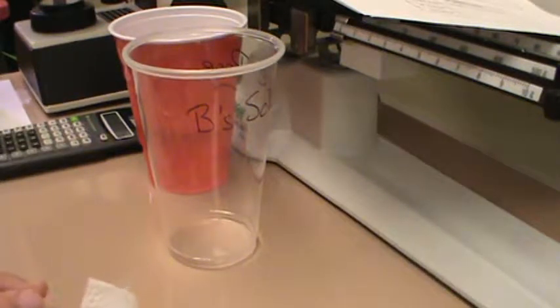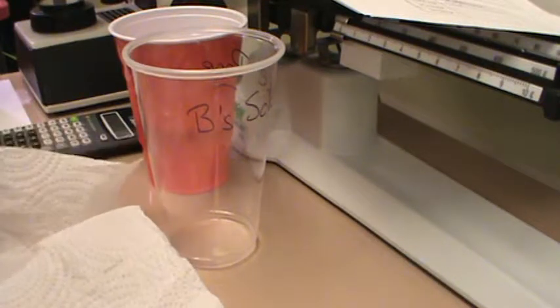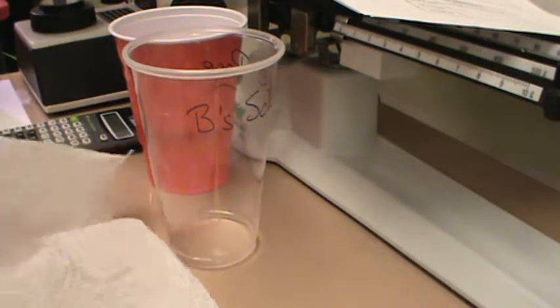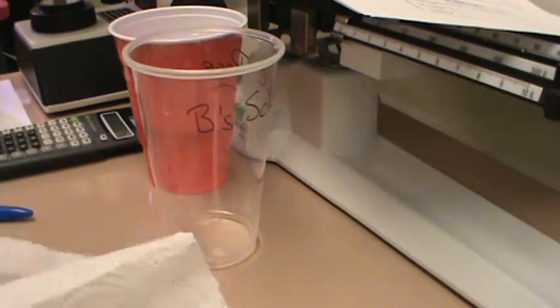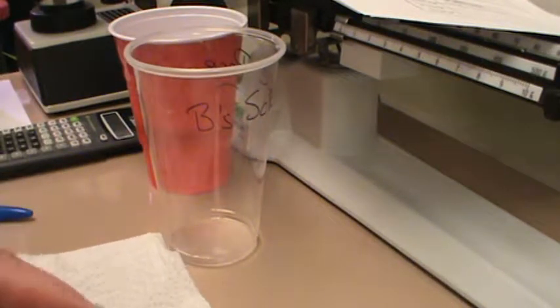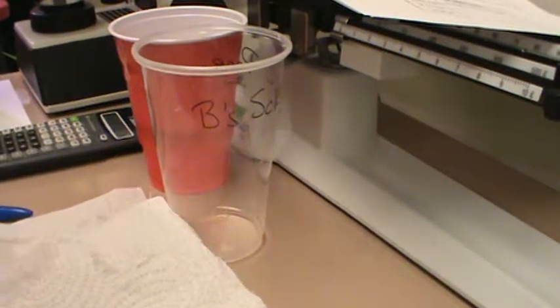Now, usually you would see any kind of mass inside the egg. In industry, it's used for blood spots, or if you have an embryonic chicken in there, you don't want to sell an embryonic chicken at your neighborhood market.